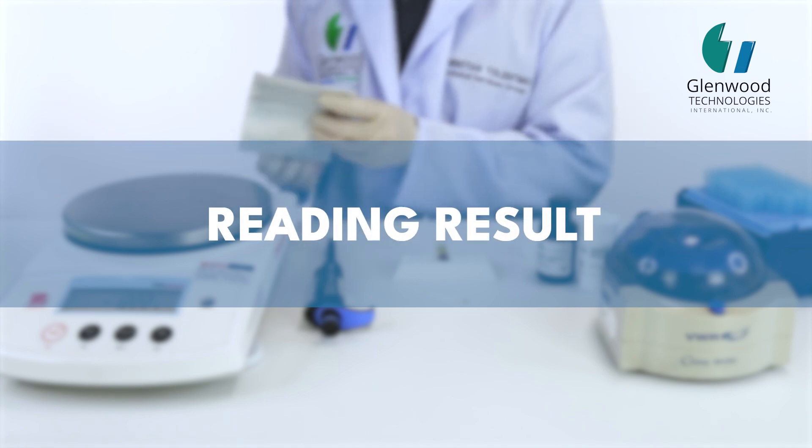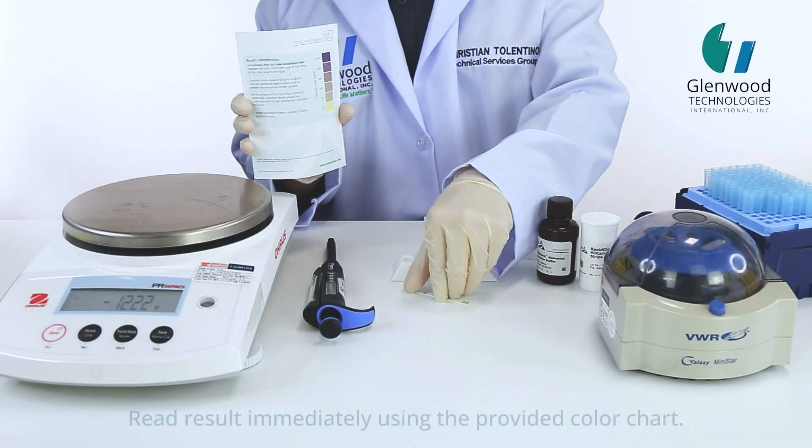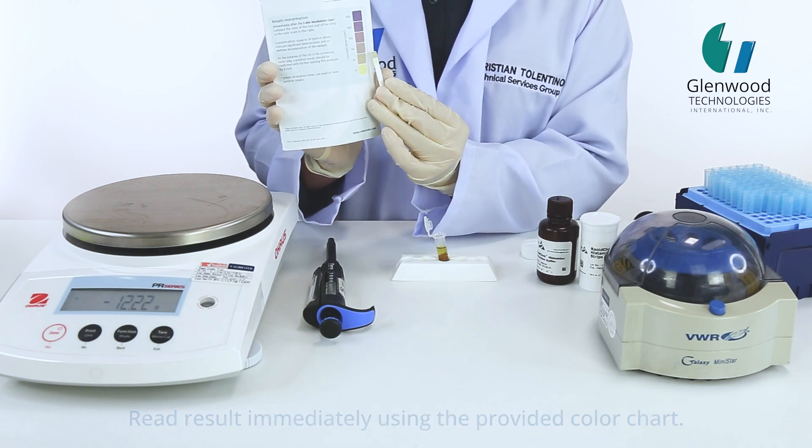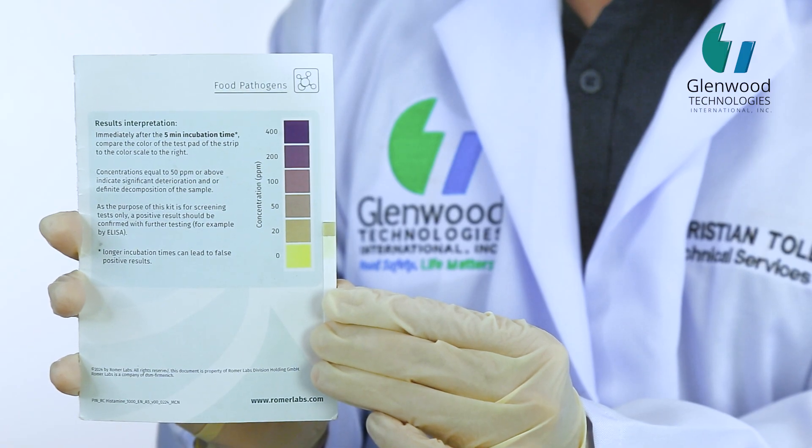Reading Result. Read result immediately using the provided color chart.